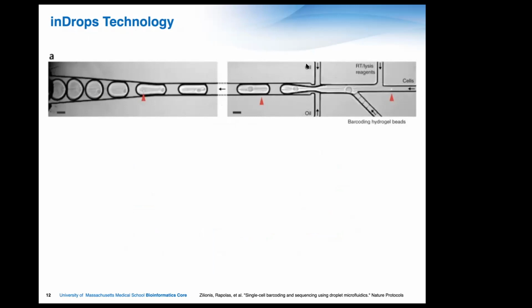They are also an emulsion-based single cell method. So everything that we're looking at here is going to be just as valid if you encounter 10x data. The only difference is the chemistries that they're employing to generate the actual libraries, but the physical principles are the same.